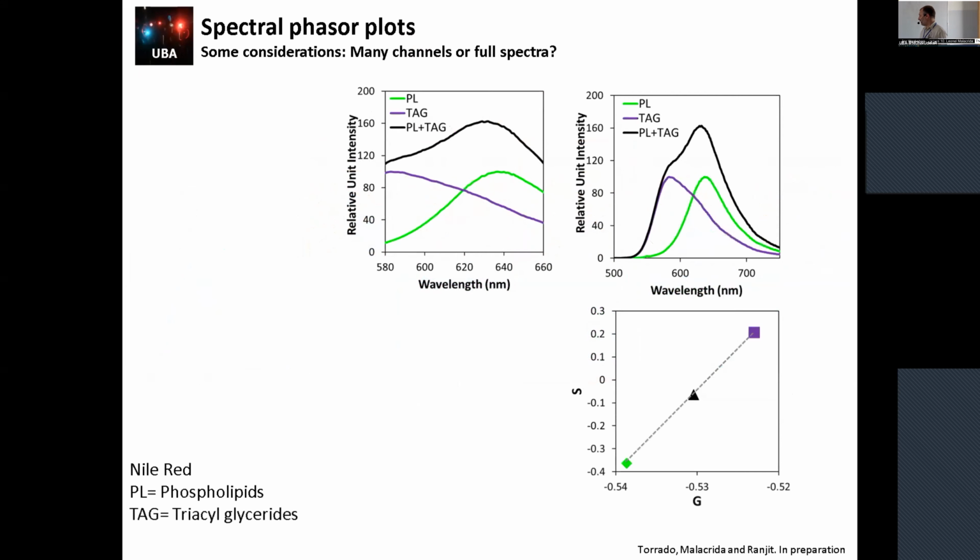So the last thing that I want to mention is the other problem, if you want to go with high resolution or go fast and chop the Phasor, so the total hyperspectral collection. If you chop one side or the other of your data, then you will not be able to claim the linear combination properties. So this is to explain one day to someone what could happen with this.